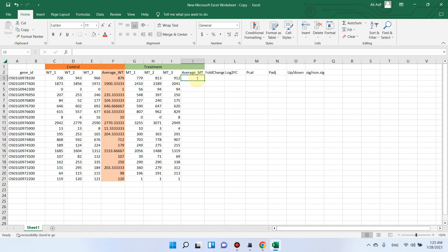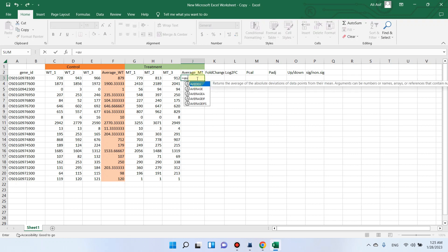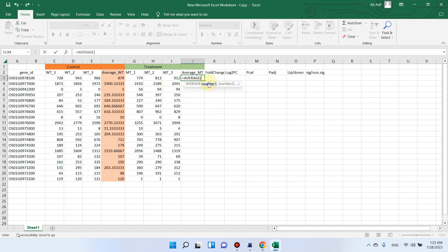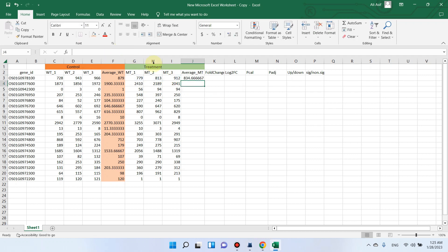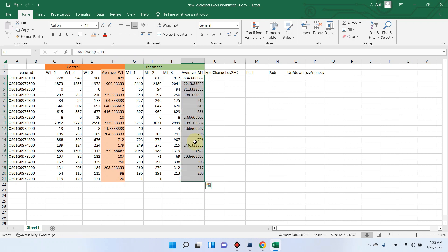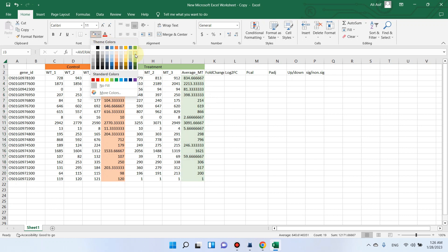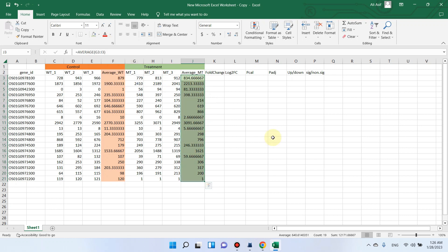Similarly, now we will calculate the average of mutant type. We can go with the formula again and write AVERAGE, select these three values, close the bracket and press Enter. Then double-click on the dot and it will automatically calculate average values for all mutant type rows. We can highlight them with a green color.